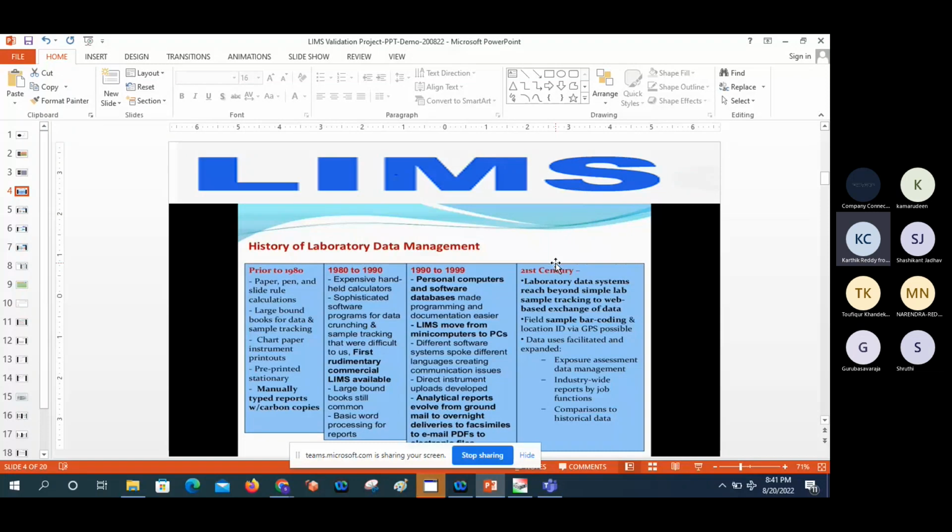The default workflow they can provide, and we need to perform all the testing from the LIMS core team, and we can finalize the environment. So it would be suitable for the end user to perform the LIMS operations.